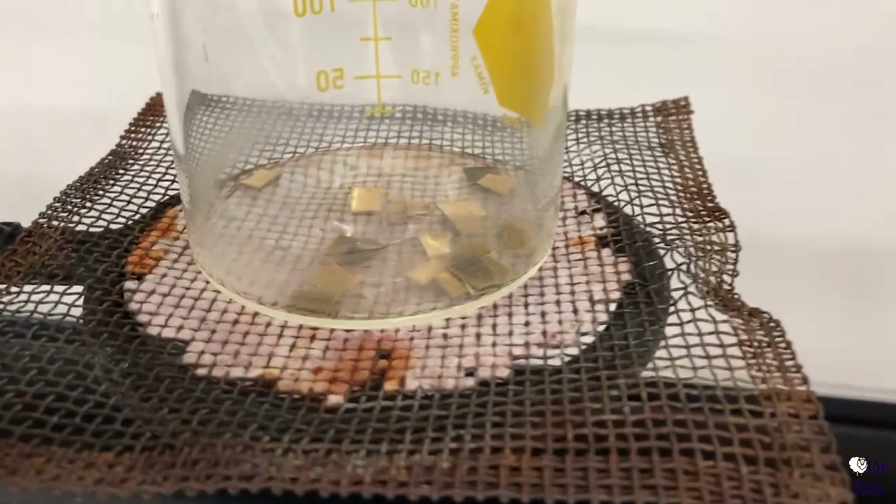I'm going to be doing it in a very large fume hood, so you won't really see the entirety of the fume hood, but you will see at some point. Let me try to escape the fume hood a little bit, take my phone out of there real fast. I'm going to have it elevated. You can kind of see the mesh that I have it sitting on. I don't recommend doing this elevated just in case it were to fall. You don't really want to lose control of where the gas is and the reaction's taking place.